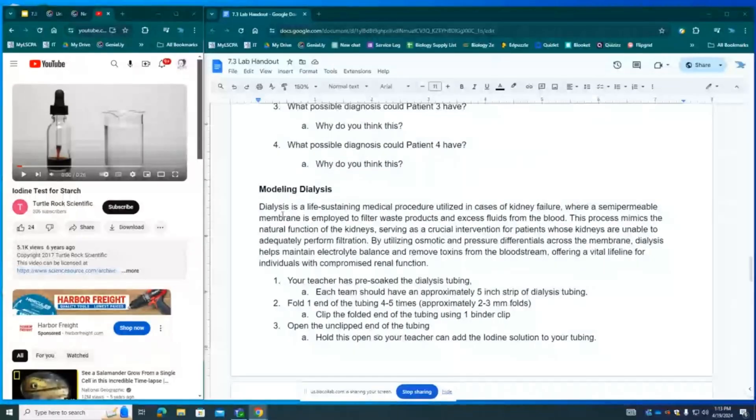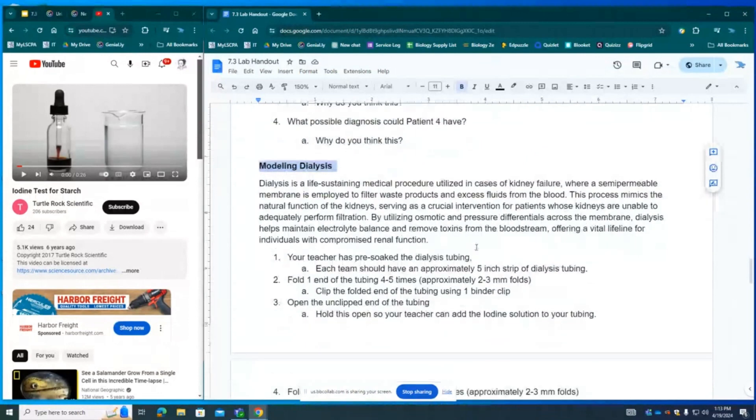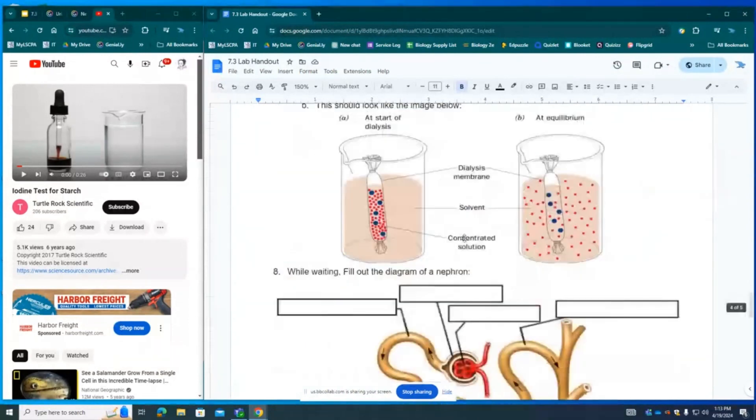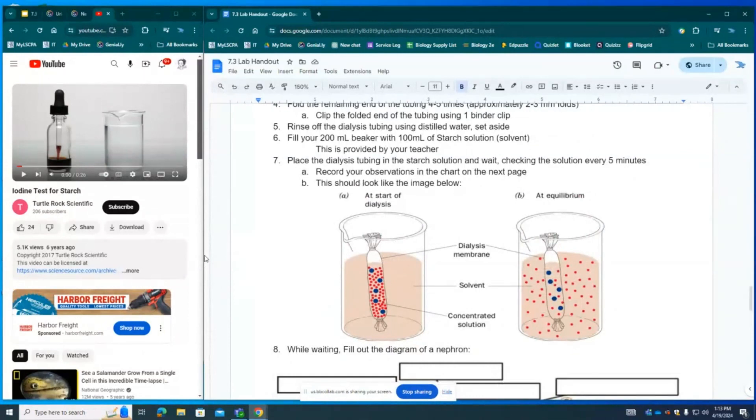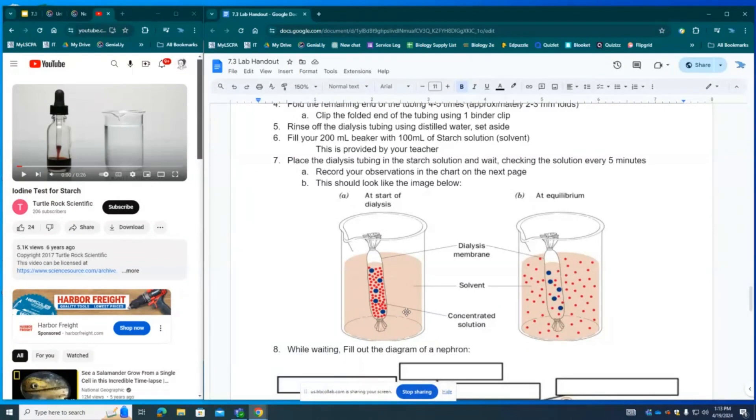Next, we will be modeling dialysis. We're going to model dialysis by setting up a dialysis experiment. And this experiment is going to be representing the process of a patient going through dialysis or the natural process that the kidneys do during normal kidney function. We're going to do this by using dialysis membrane, which is a semi-permeable membrane made out of cellulose. So small molecules can fit through it, but very large molecules cannot.